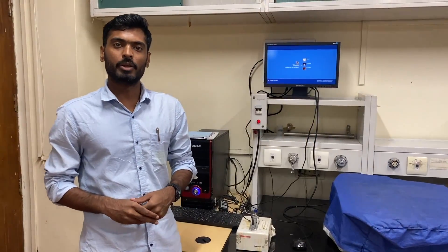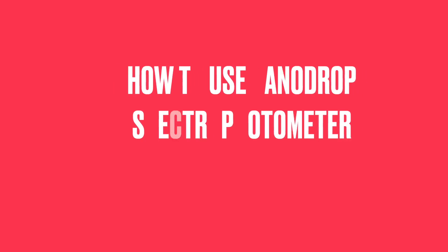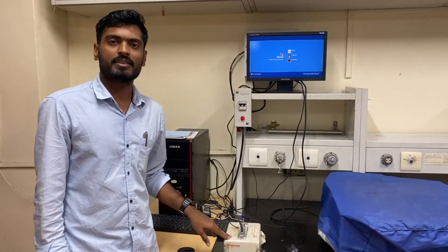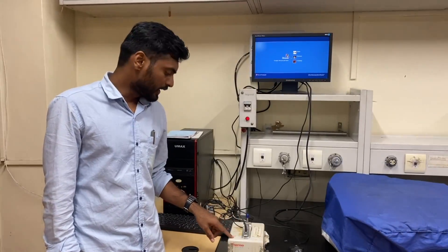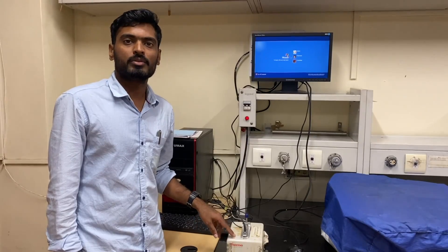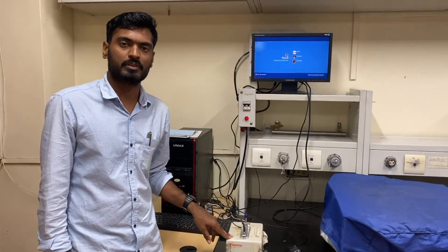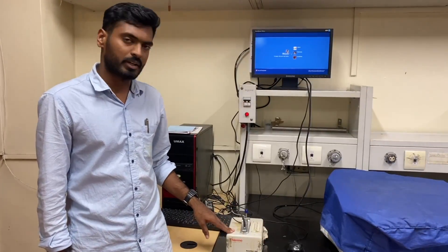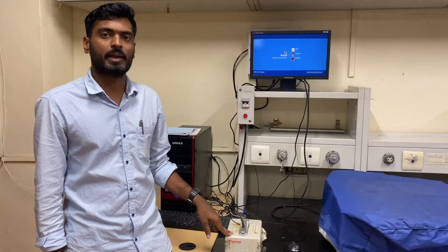Hello and welcome to another video tutorial where I will show you how to use the NanoDrop spectrophotometer. The NanoDrop spectrophotometer is a device that can measure the concentration and purity of DNA, RNA, and protein by using small amounts such as 1 to 2 microliters of sample. Today I will show you how to use this NanoDrop spectrophotometer, taking a DNA sample as an example.